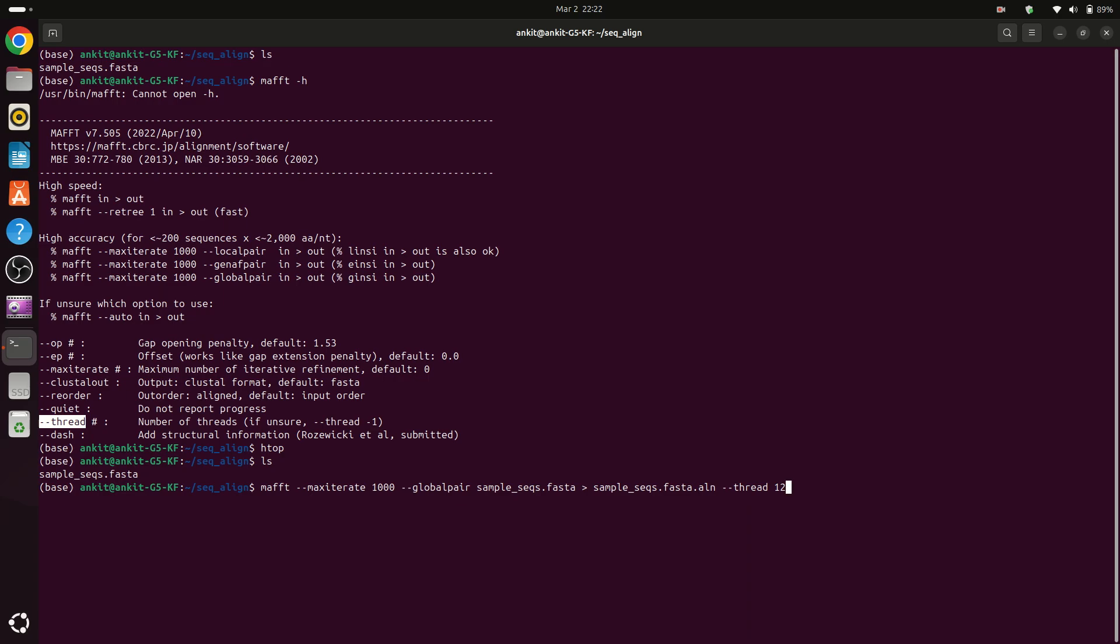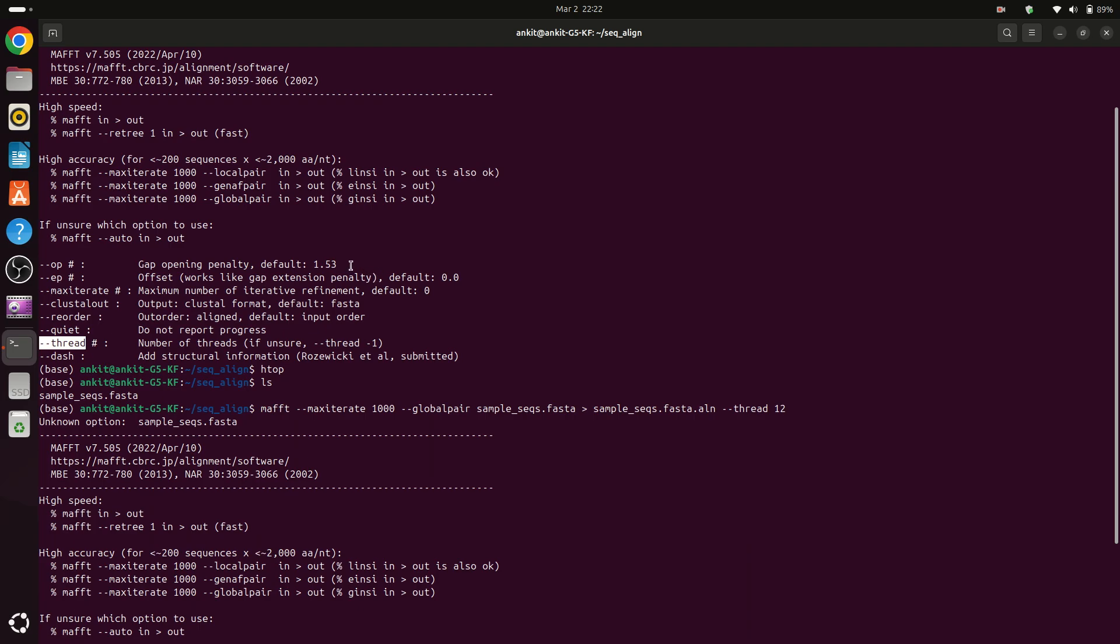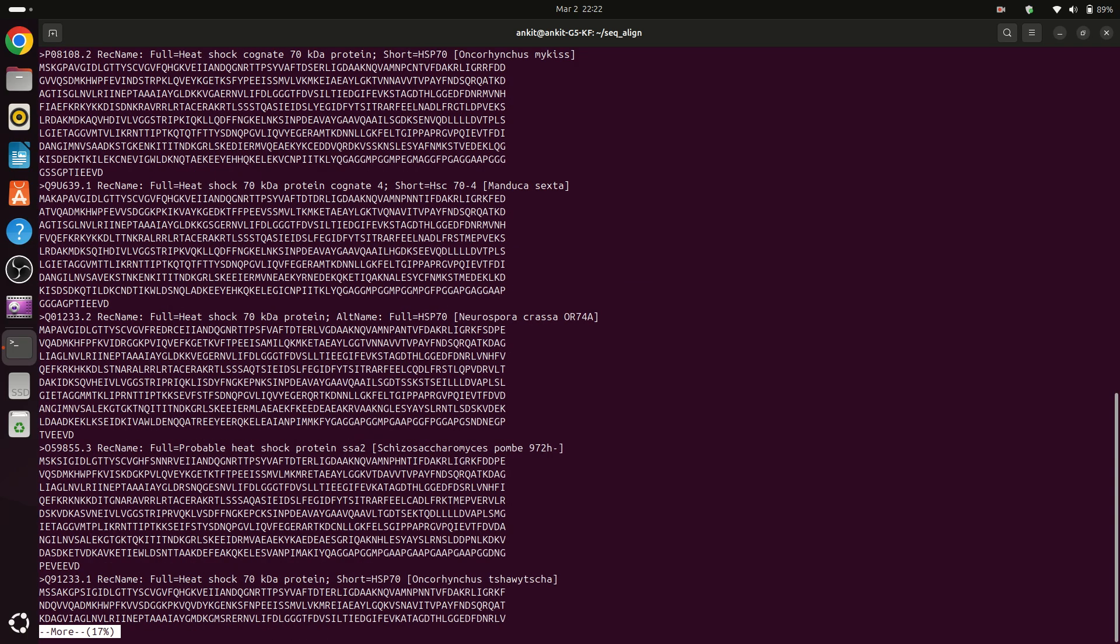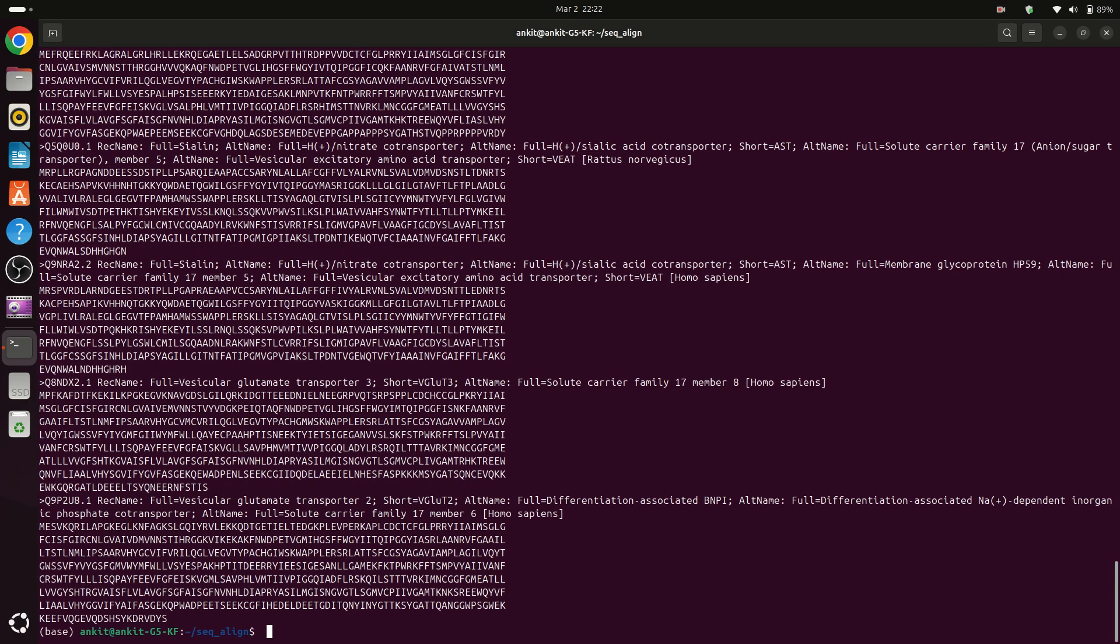So now press enter. Now what it is saying is unknown option sample.fasta. Okay, so sample.fasta, this file is okay, then what is the problem?